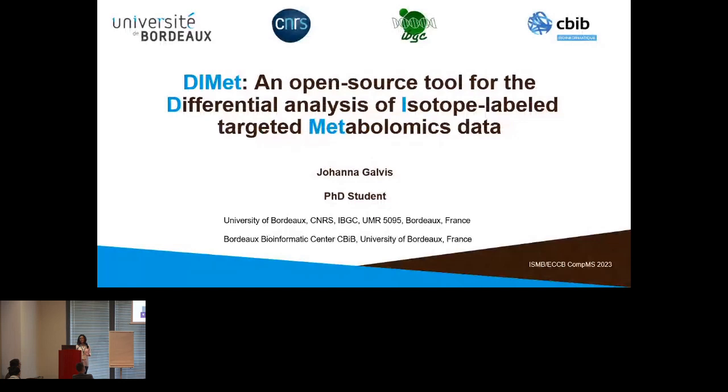And we are currently working to offer the community a web interface via Galaxy Europe that is ongoing and has the advantage that the user can just, by the graphical interface, provide all the parameters without configuring the files himself.